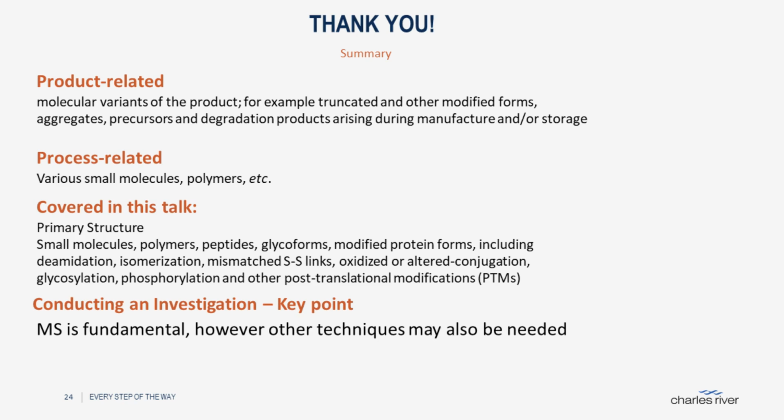The ELISA itself, as I mentioned, doesn't tell you which proteins are actually present. And having some knowledge about that can be quite useful if it's incorporated early enough in your program. And that's where mass spectrometry really comes into play, is that it can identify what those proteins are and then be able to monitor them to make sure also that your ELISA is actually catching those specific proteins.